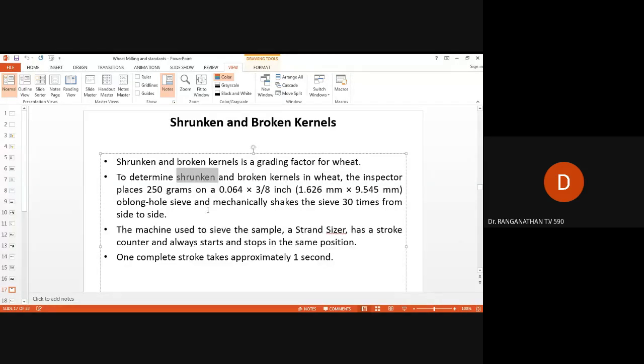So what is normally done is that you pass the flour to it, and then it's allowed to sieve. During the sieving, sieves are arranged based on the varying sieve size. Now, one is a sieve analyzer which you would have seen in your chemical engineering lab.